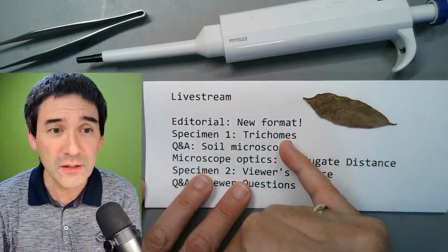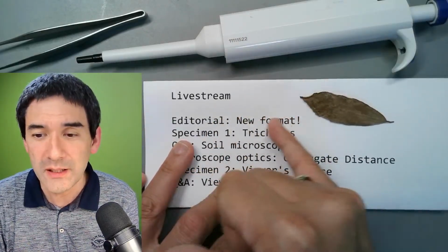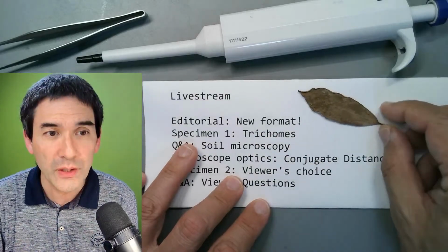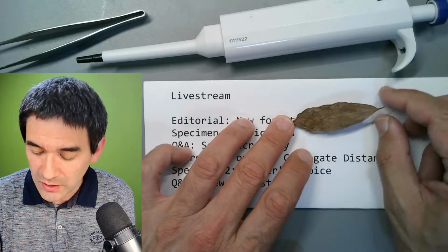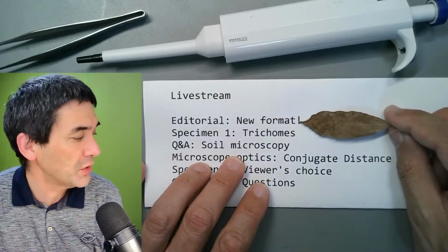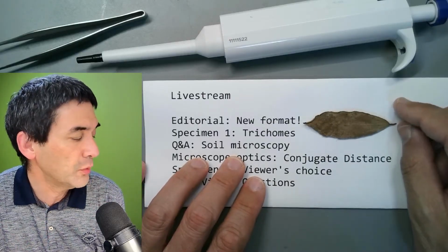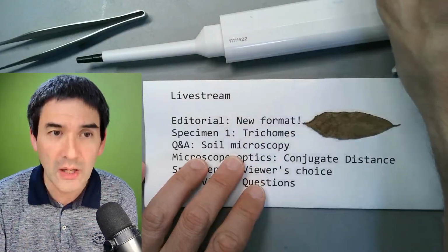So what I've done is the following. Currently I'm still in the editorial for 15 minutes, right? Then I would like to show you, and we're going to make a slide with trichomes, for 15 minutes. I'm going to make a permanent slide here because I think they look kind of nice. Then I would like to answer questions about soil microscopy. I got 3 questions here about soil microscopy that I would like to talk about, and I did also prepare a soil sample here that we can look at.